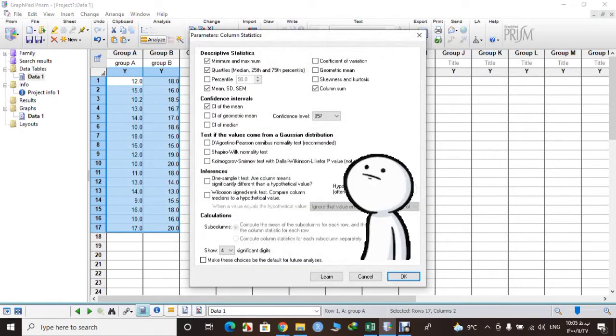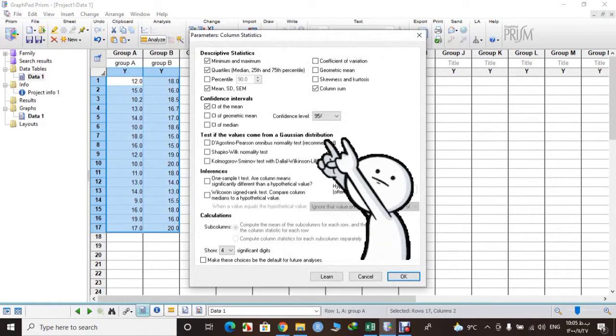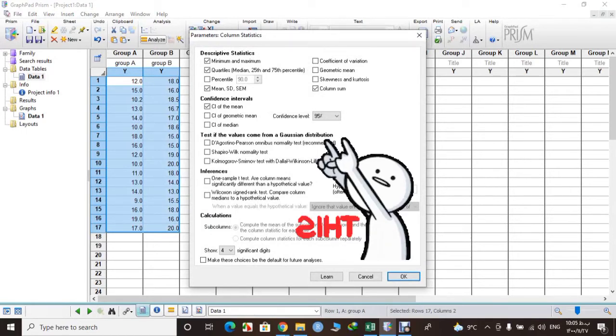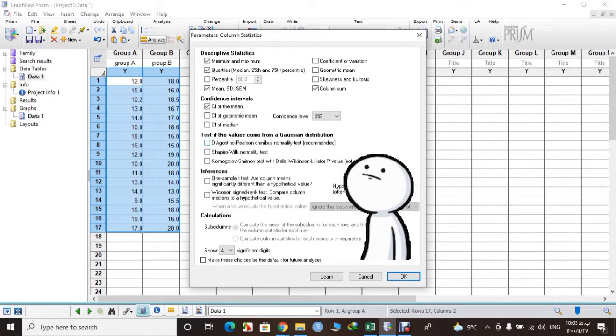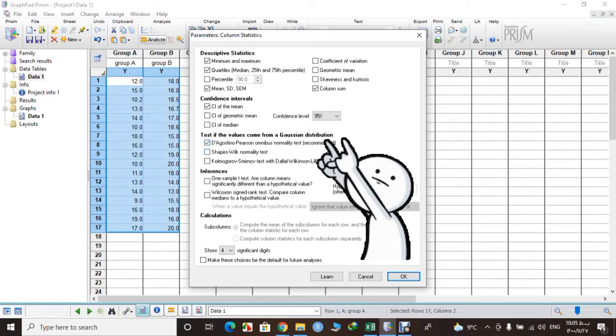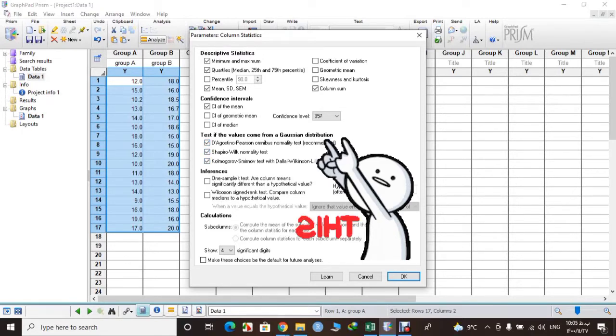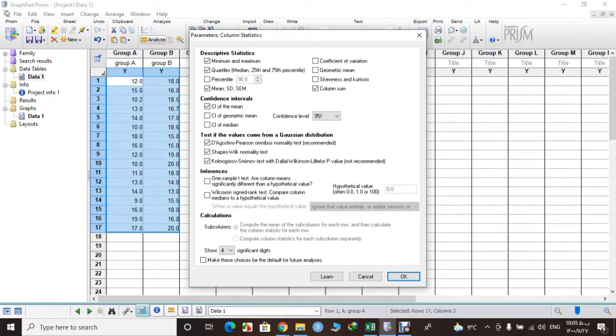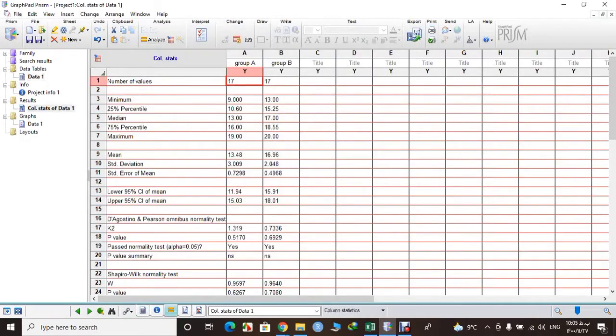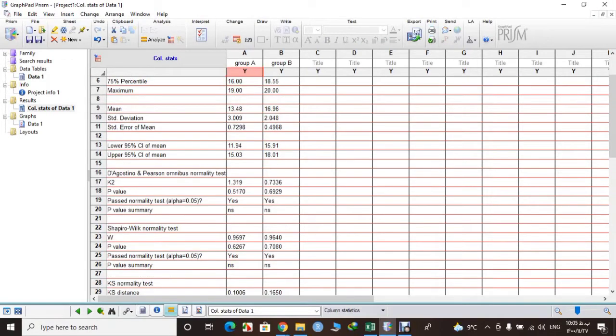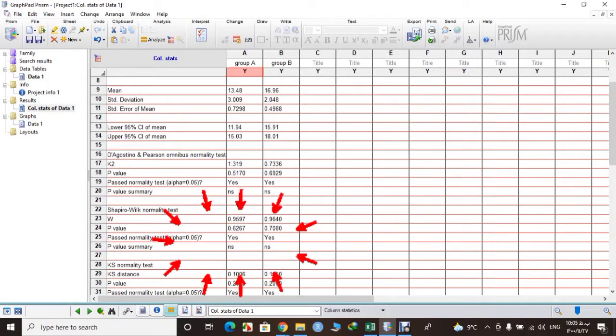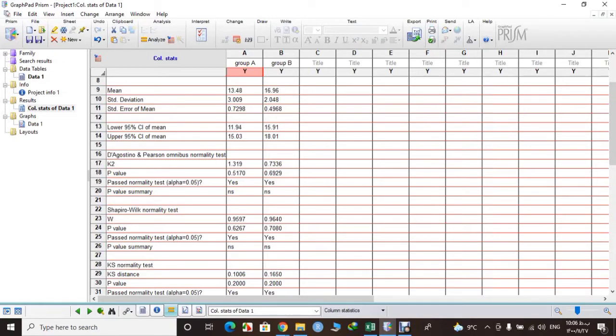Then you need to select three options in Gaussian distribution. This is what we are looking for. We want to check normality, so don't change anything else. Click okay and here are our data. You can see that our data has normality test and it's done. Now we can see how to perform one-way ANOVA.